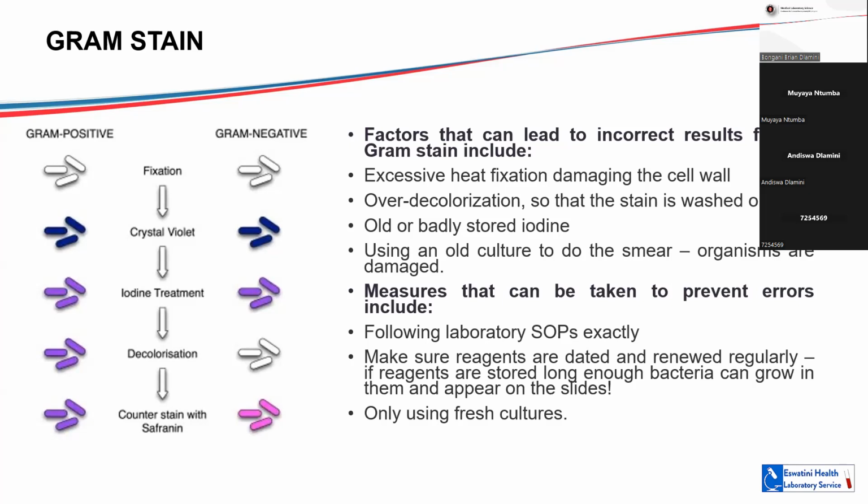Some measures that can be taken to prevent errors include making sure that you follow the laboratory SOPs. If it says 2 seconds or 5 seconds or 2 minutes, make sure you follow that. Make sure the reagents are dated and they are renewed regularly, because if the reagents are stored long enough, bacteria may grow in them and appear on the slides.